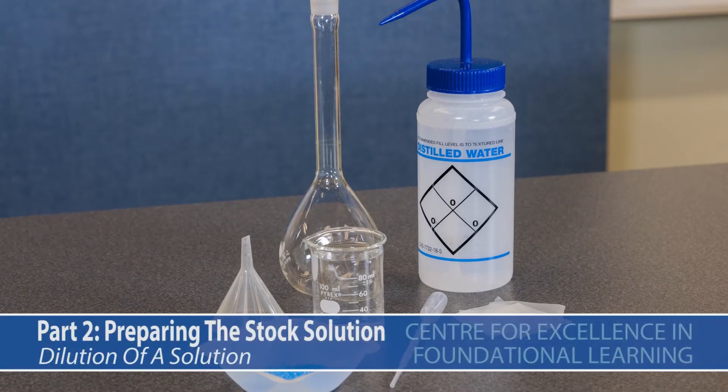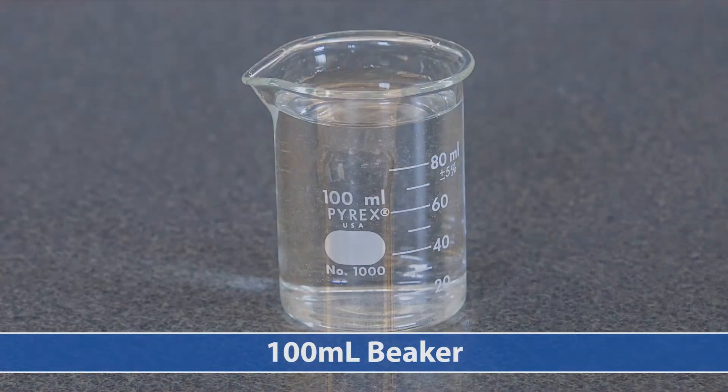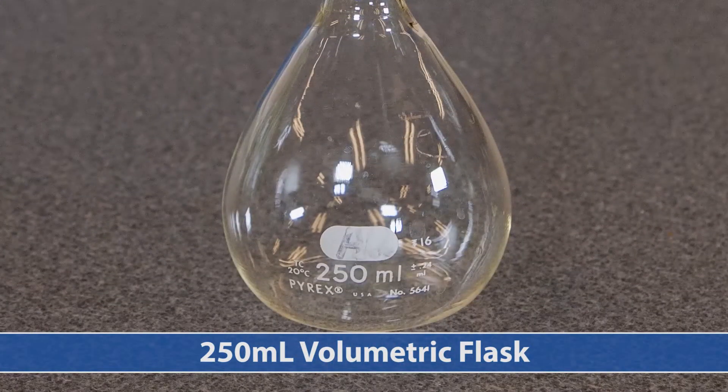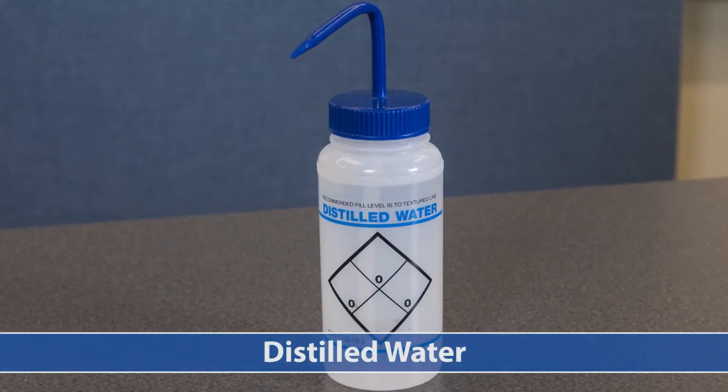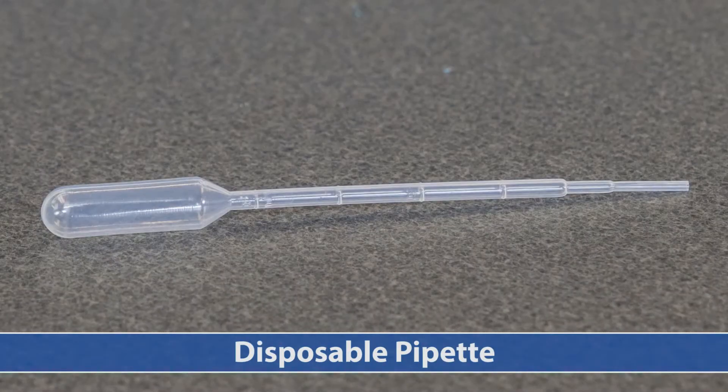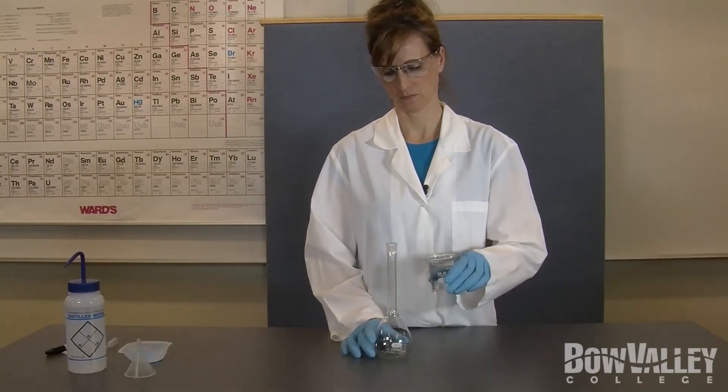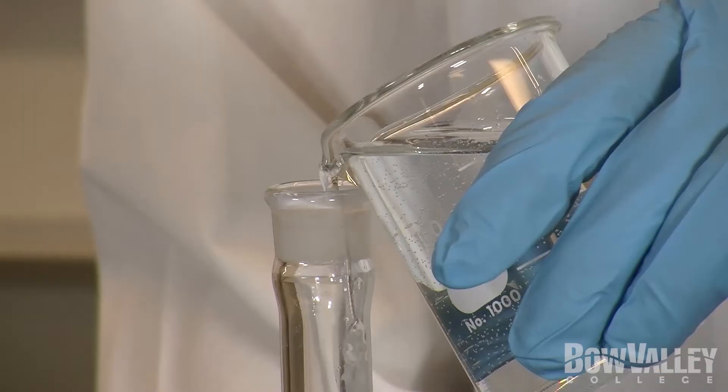To complete this step we will use the following apparatus: a powder funnel, a disposable pipette and a marker for labeling. First we will need to pour water into the volumetric flask until it is about one third full.